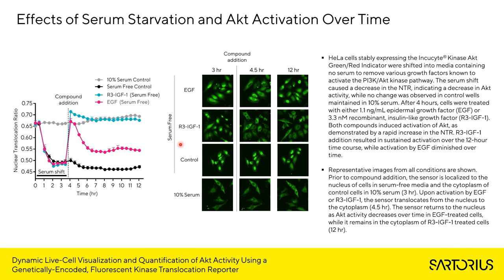Prior to compound addition, the sensor is located to the nucleus of cells in serum-free media and the cytoplasm of control cells in 10% serum. Upon activation by EGF or R3-IGF-1, the sensor translocates from the nucleus to the cytoplasm, as shown in the 4.5-hour images in the center.